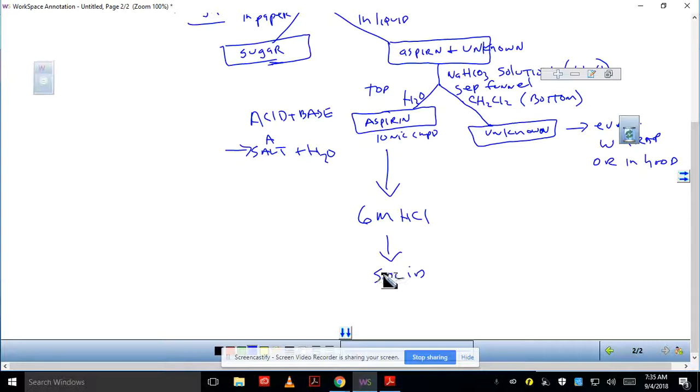So in this case, what you'll do is weigh the vacuum filter paper now, and then vacuum filter this, and so you'll have a solid and water together after you add this. You'll magically see, just like you did in the benzoic acid lab, the solid reform, just like we did in lab 1. A lot of these things carry back and revisit each other.